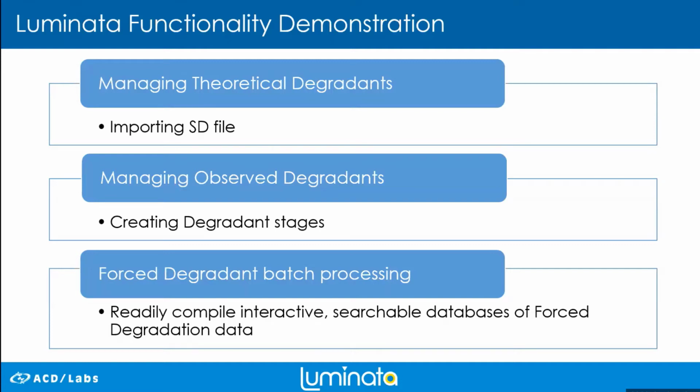Then finally, I'll show the batch processing capability within Luminata for stress testing, compiling information for all of your predicted degradants in one location. So we'll go through that and then go back to the slides.